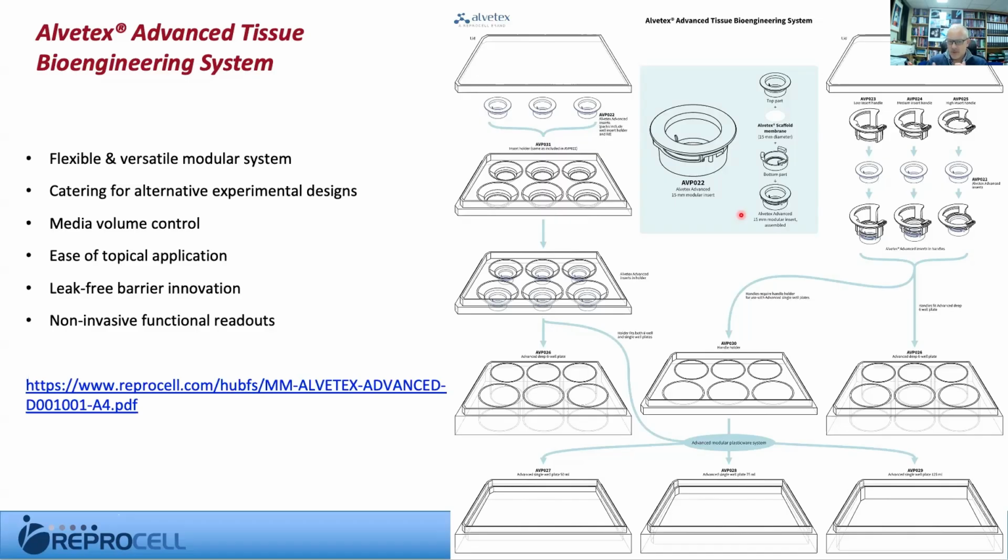And we've also, as I've mentioned, created designs for non-invasive functional readouts. So this means maintaining a model in the incubator, taking it out, taking a reading, and then putting it back for another period of time, and then repeating the process. So you can do chronic studies on live materials. So for the action of a compound over time, for example.